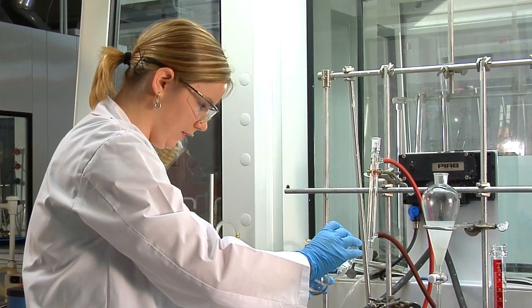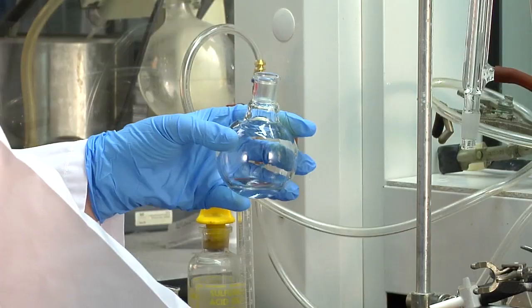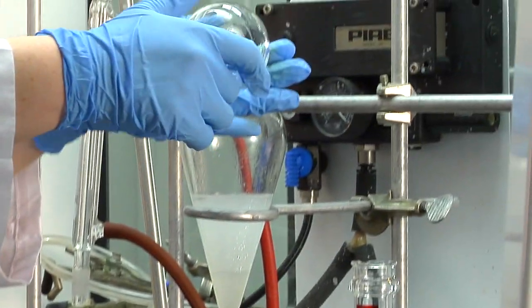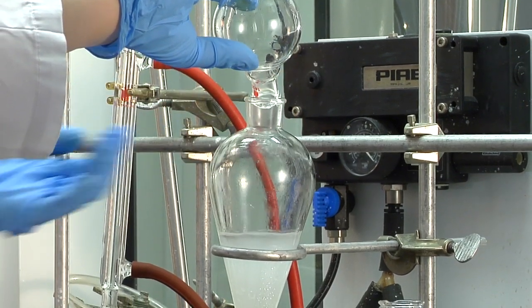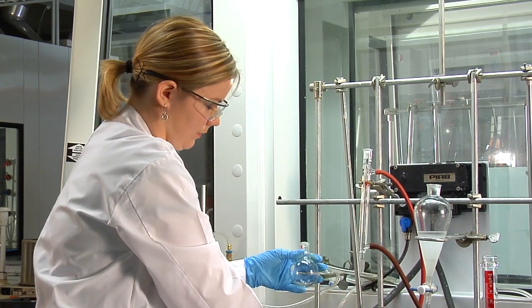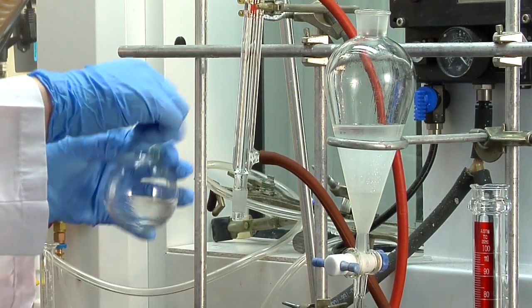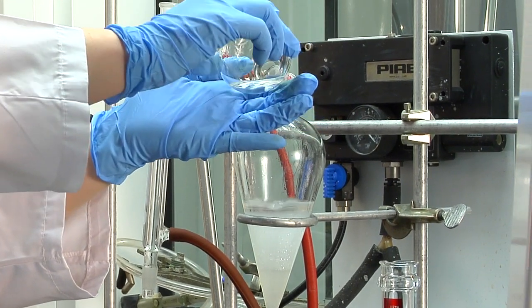And I'm going to do that rinse again. I'm going to split my 25 mils into 3 different portions just to make sure I get a good transfer. And then one more time. So that will just make sure that we get the best yield that we can.